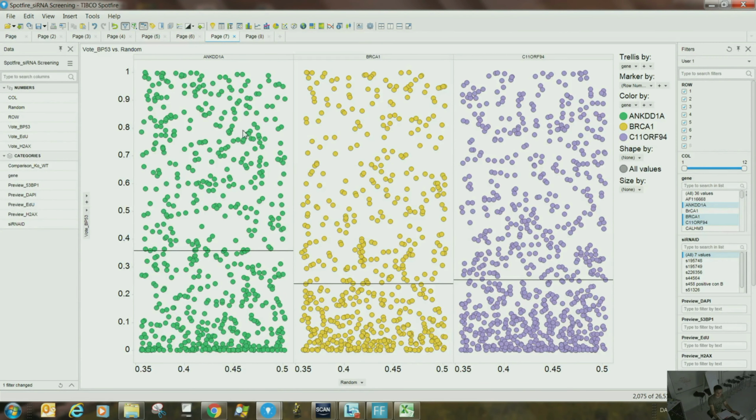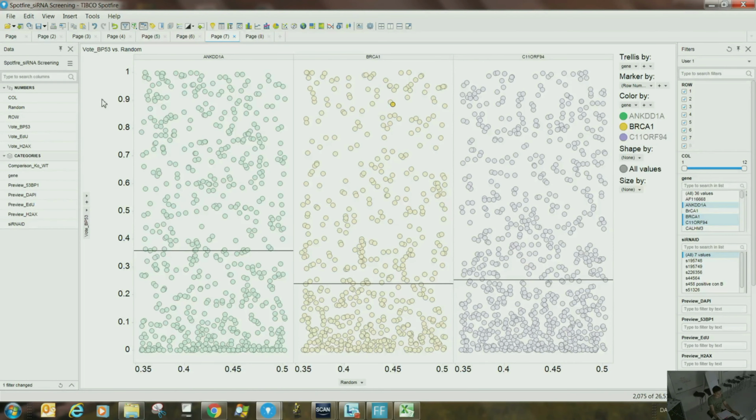So I think we have covered all of them, right? Nothing remains. Oh yeah, one thing remains: if you have a main object and a sub object, how to combine them together.